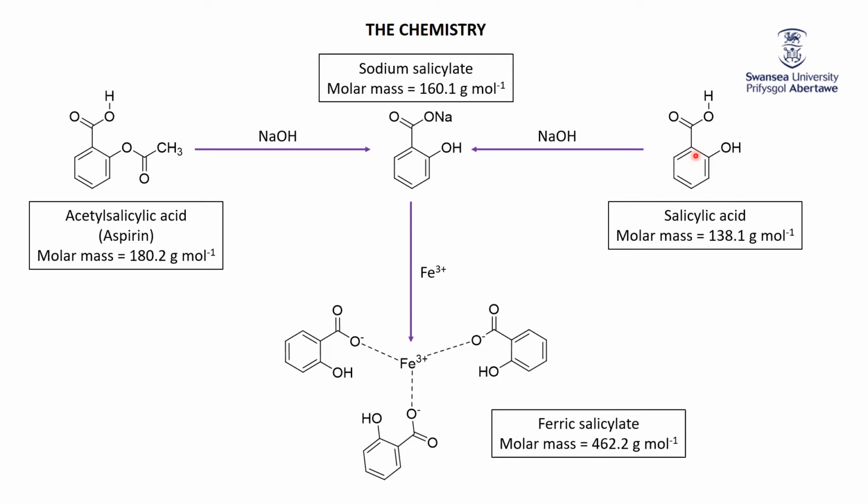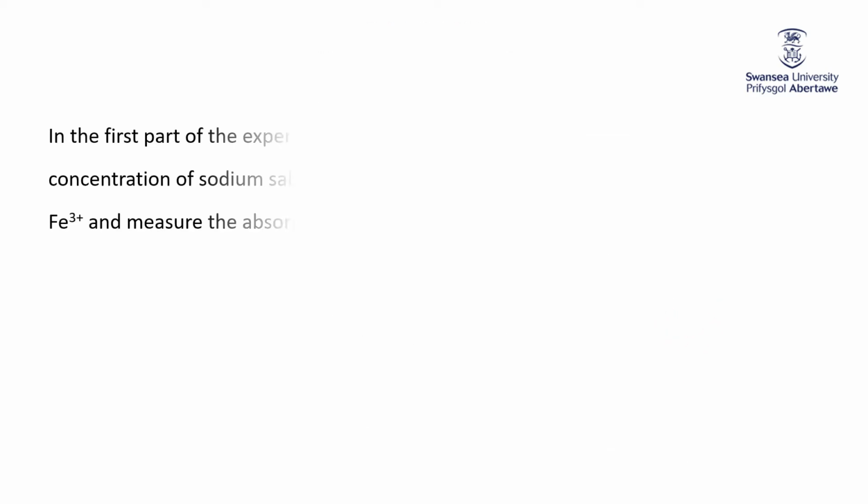So we're going to use salicylic acid to develop all our known values, our epsilon L, and then we're going to take some unknown aspirin, going again through sodium salicylate, to determine how much aspirin we have in there. Hopefully that vaguely made sense. As we go through, anything that's unclear might become clearer if we're lucky.